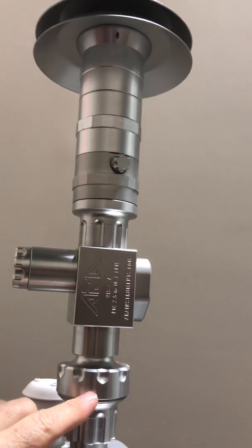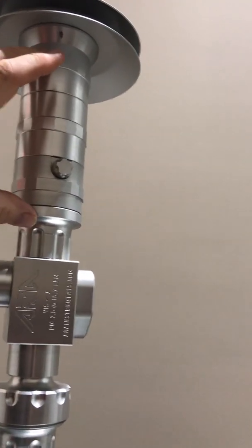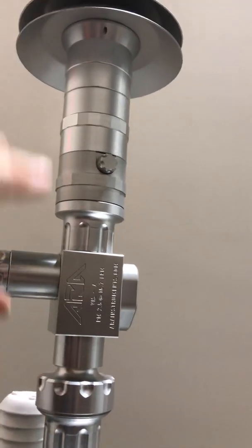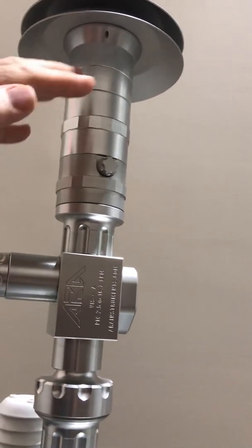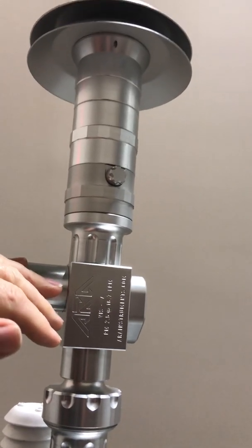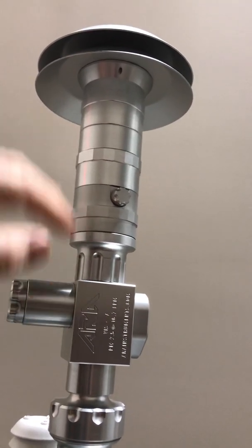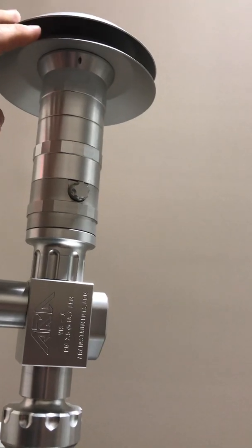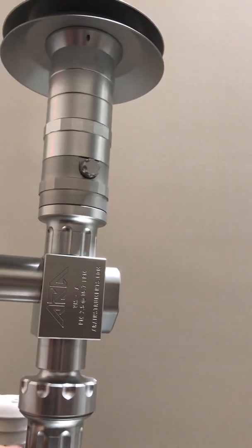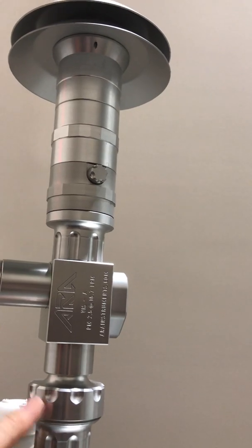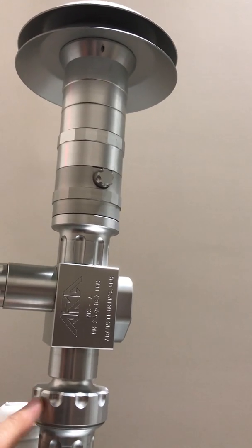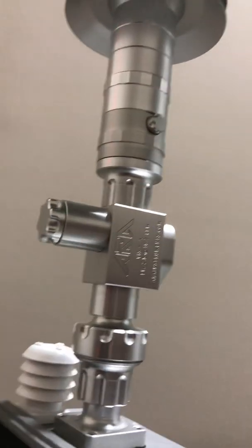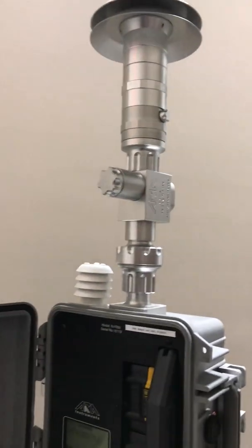If you just want PM10, you just have this attached to the top of the filter. If you want 2.5, we have it in this configuration with the 10 and the 2.5 cyclone. If you want just total suspended particulate, we'll simply attach this top lid right onto the top of this module, and that just gives us total. So it does all three: PM10, PM2.5, and total.